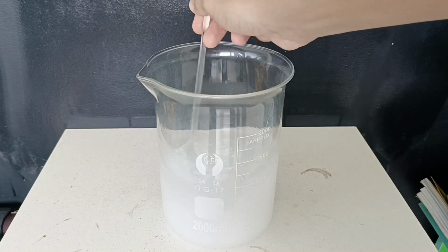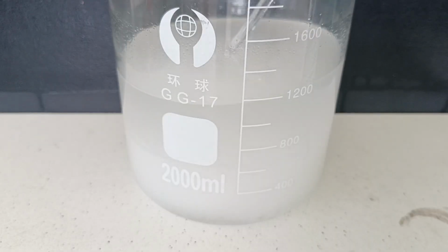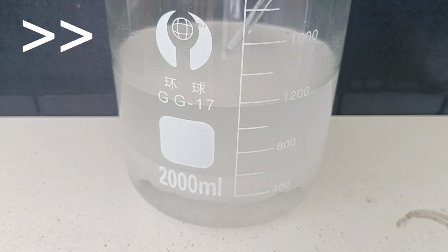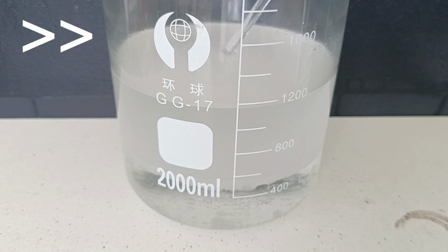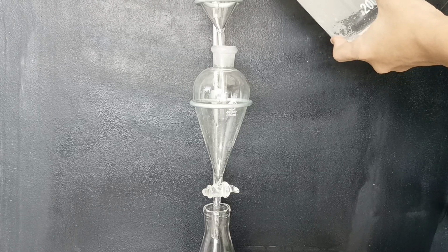I then mixed around the solution with a stir rod and allowed the layers to separate. The upper organic layer contains our toluene, some naphtha, and a little bit of the other components. Once the layer settled, I then poured some of the upper layer into a separatory funnel.